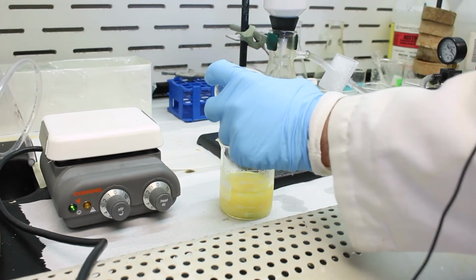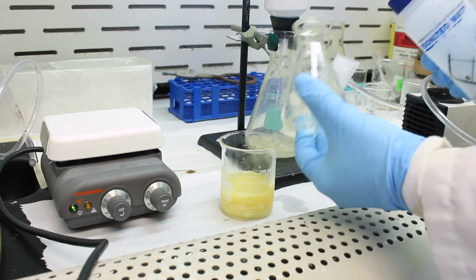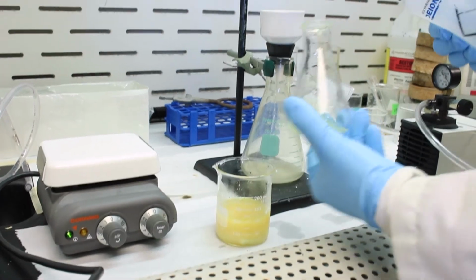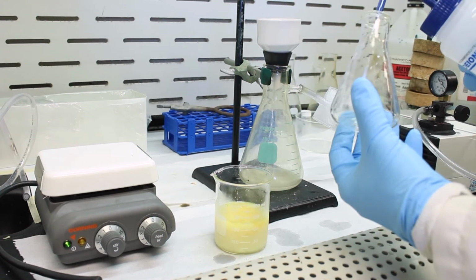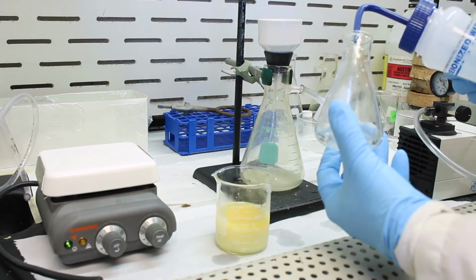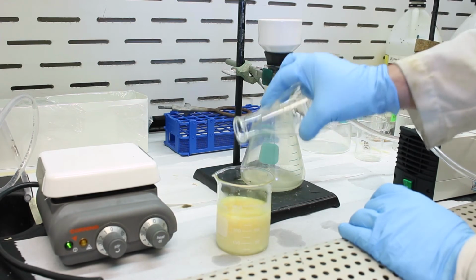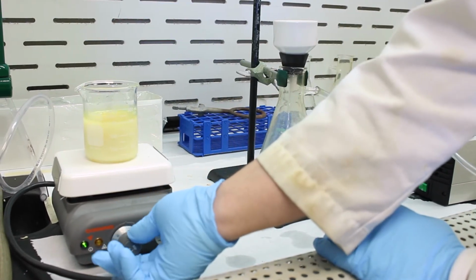And then we'll use some water to rinse out the flask. Okay, there we go. I think we'll add a little more water too to make sure there's so little acetone that it precipitates from the solution. Okay, now we'll stir this.